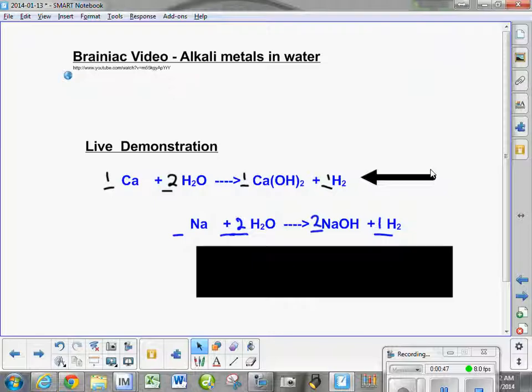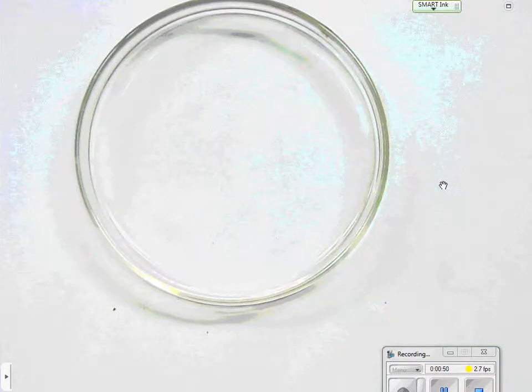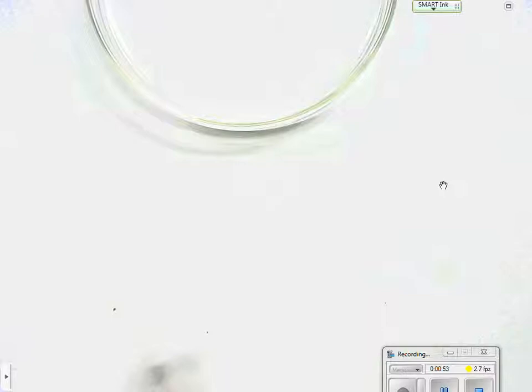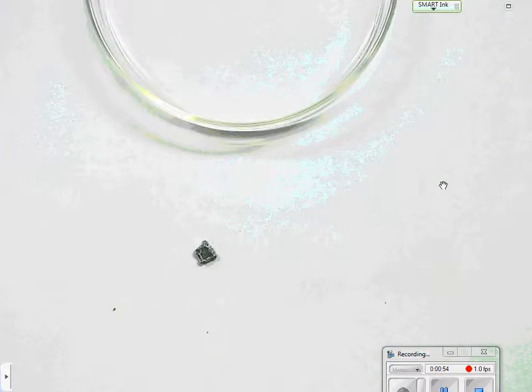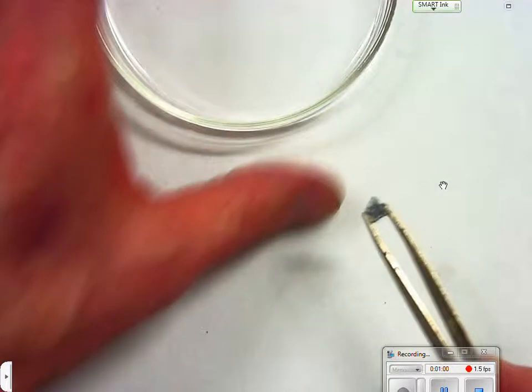And now we're going to look at a piece of calcium here. Let's show it on the paper. Okay. You can see there is a piece of calcium. It's a little corroded, so it will take a little while before it starts to react.